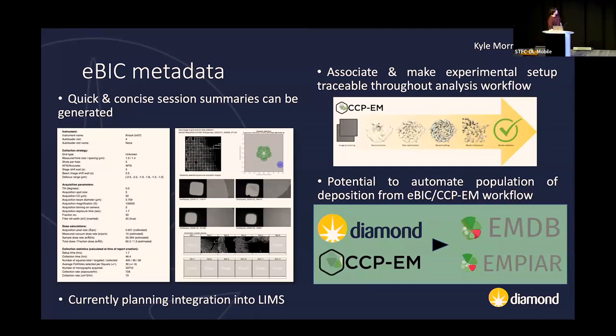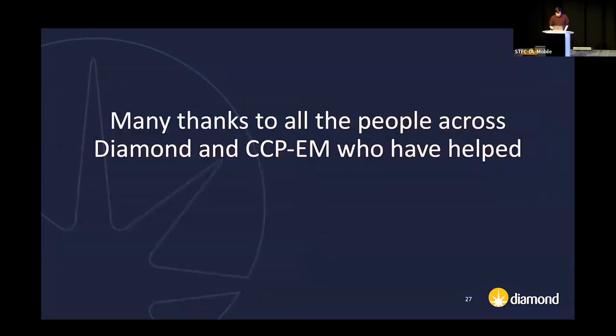You can produce these session reports for users, which give a simple summary of your data collection, the parameters you used, how many shots you were doing per hole, that kind of thing. We're currently planning how to integrate that further into our information management systems, to make it searchable and things like that.